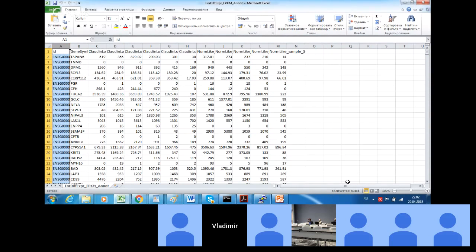And here we have about 60,000 genes. The majority of these genes simply have 0 expression, but the question is how to identify differentially expressed genes quickly. Units that are used here for the quantification of expression levels are fragments per kilobase per million, so FPKM.